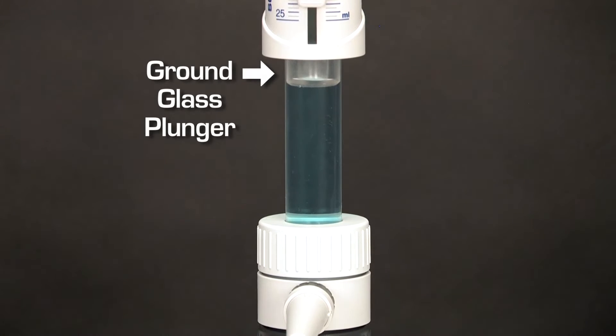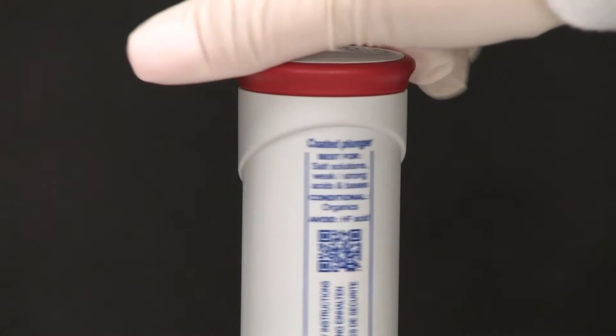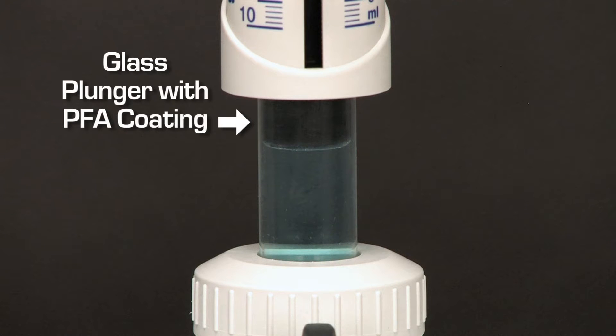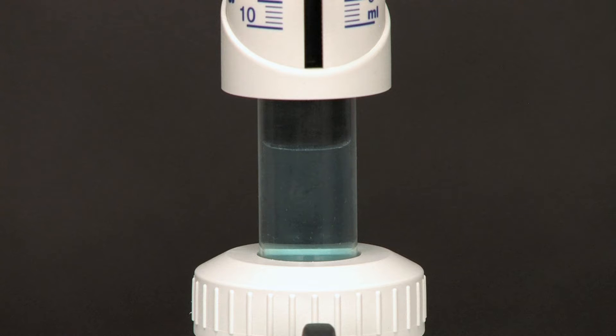Models up to 10 milliliters have a ceramic plunger. The Salute model is best suited for salt solutions, weak and strong acids, and bases. It features a glass plunger with a PFA coating, and models up to 10 milliliters have a PFA-coated ceramic plunger.